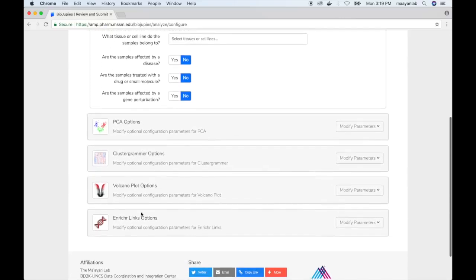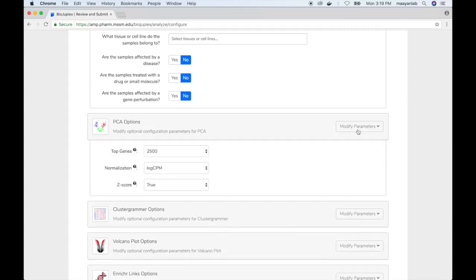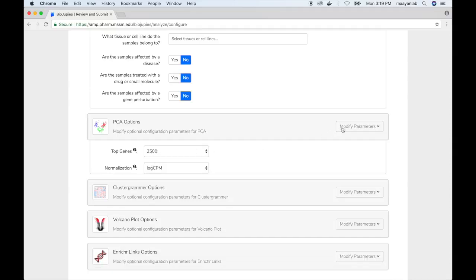Optionally, the user can modify parameters for each of the tools. In this case for PCA, modify the normalization technique, whether to apply Z-score, and the amount of genes to be used for calculation of the principal components.